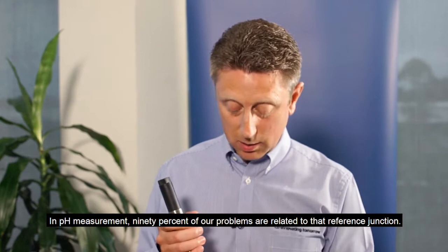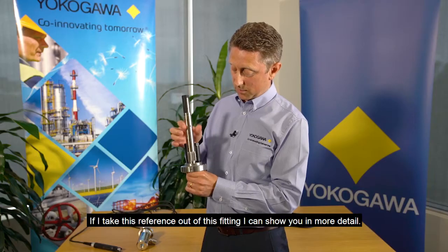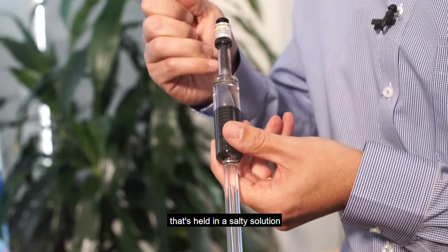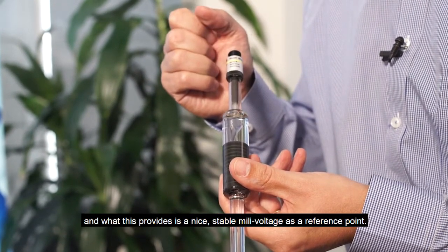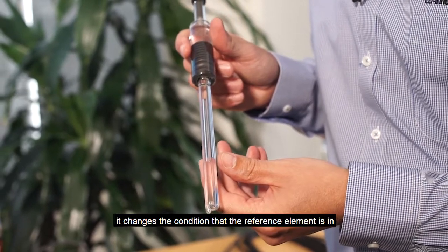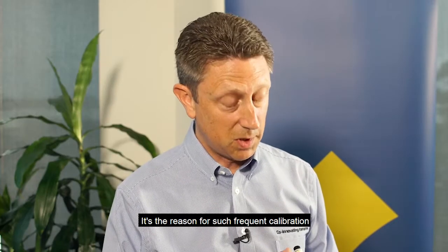In pH measurement, 90 percent of our problems are related to that reference junction. If I take this reference out of this fitting, I can show you in more detail. A reference element is actually a silver/silver chloride pin that's held in a salty solution, and what this provides is a nice stable millivoltage as a reference point. But over time, this salt solution depletes. The process can enter from the bottom, it changes the condition that the reference element is in, and that's where drift comes from in our pH measurement — and it's the reason for such frequent calibration.